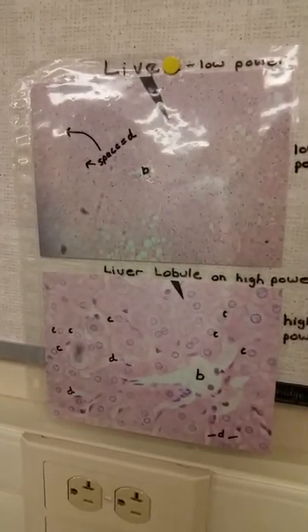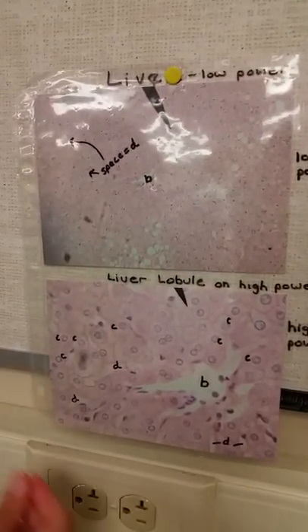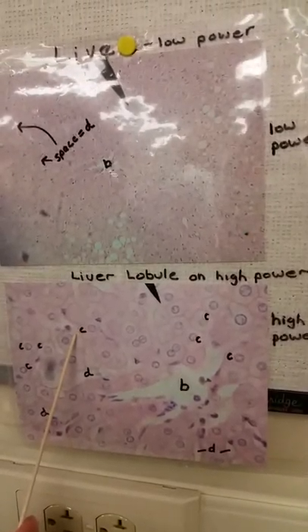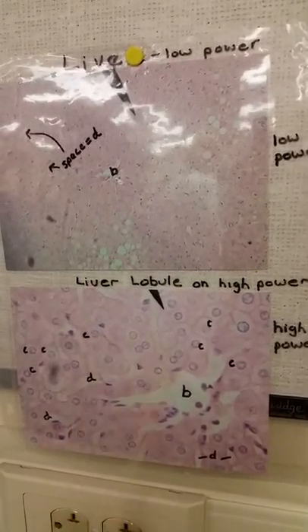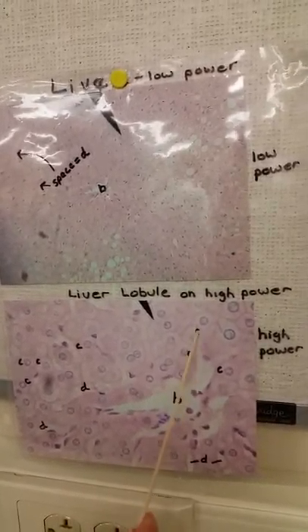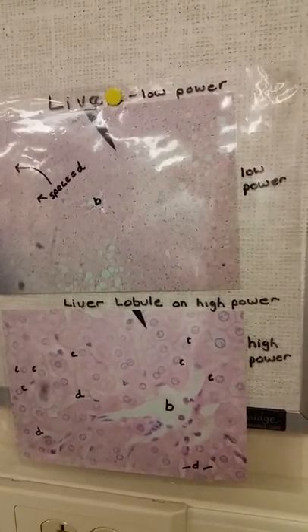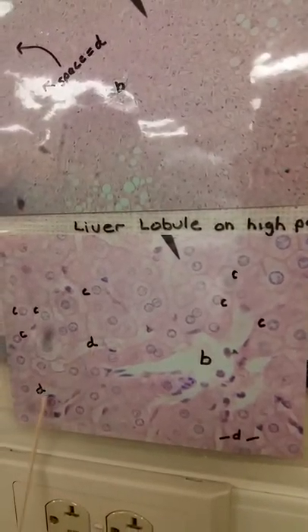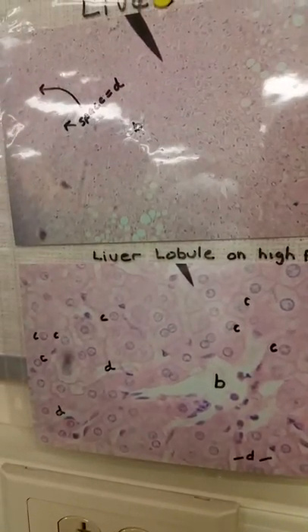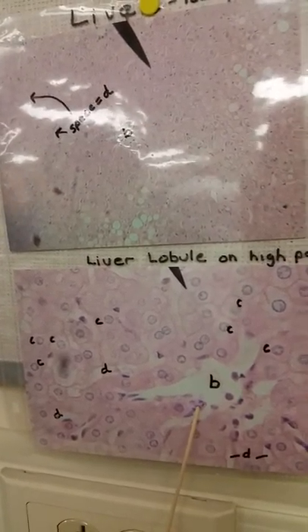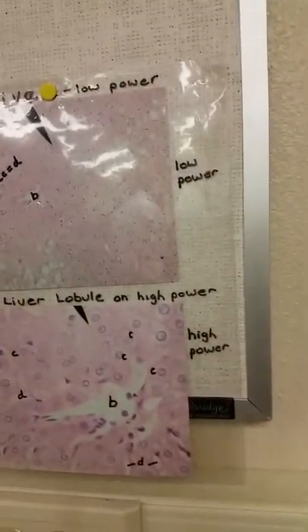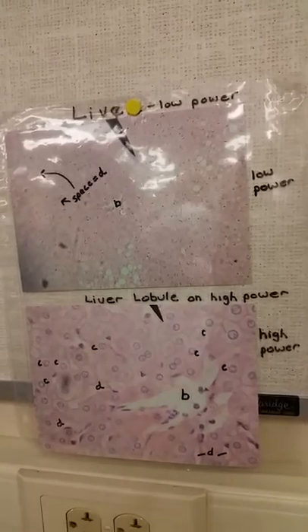Moving on to the liver, in high power. This is the hepatic cells or hepatocytes, these here. This would be the sinusoid. And then these would be the central veins, these here. And then this whole thing is called a liver lobule, which this is the high power.